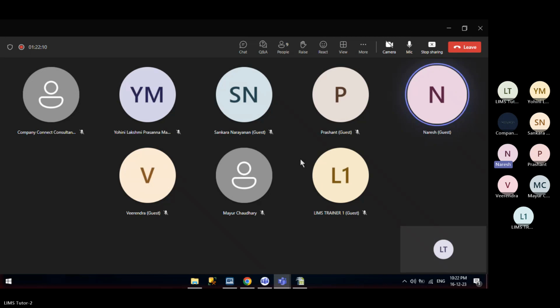Some of my friends are working on Labware as end users. They are using Labware totally for the investigation cycle and routine analysis. That's why I'm asking. They are completely on it. They don't have any other QMS applications. They don't have TrackWise or a QMS system, that is why they are using it. Okay, but I'm sorry, we are not going to cover that.